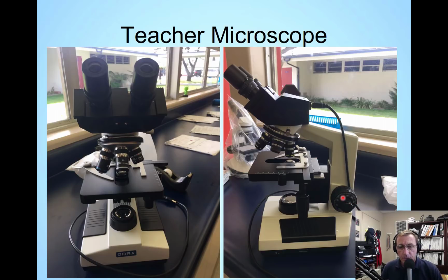And also here we'll talk about these coarse and fine adjustment knobs, but here you see a great example. It's even got indicators on it to show you how precisely you can adjust it. You'll see more about that later. Got a cool light source here, nice and bright, and again you can adjust the aperture to let in as much as you need to. And you guys won't touch this without permission, though, sad for you, but it is really awesome.